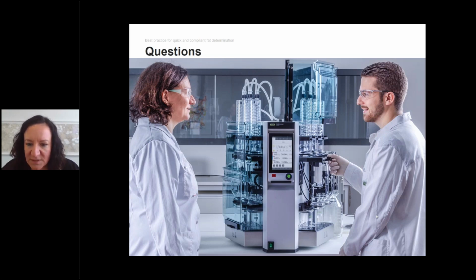How to dry the sample before the extraction? Is a temperature of 70 degrees sufficient for forage? We always dry samples at 100 degrees to be sure that the water has really evaporated. Sometimes this high temperature can deteriorate your sample type. I'm not so familiar with forage, how this behaves. If you dry at 70 degrees, this would really extend the drying time that is necessary. Maybe you need to do some intermediate grinding or stirring of the sample to increase the surface and turn it around. Or if you really need these low temperatures, you can also use a vacuum drying oven to increase the drying efficiency at lower temperatures.